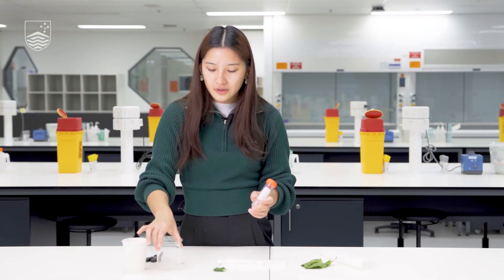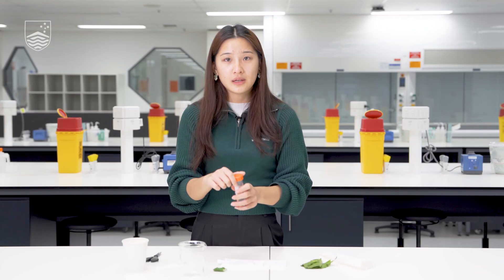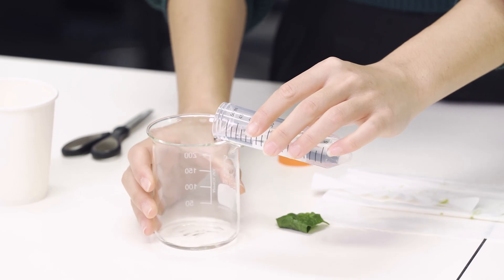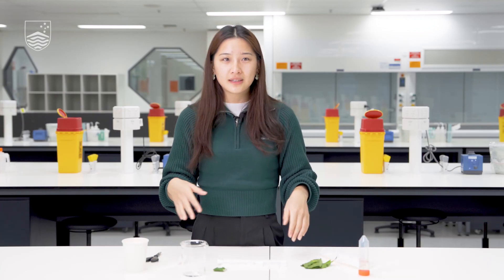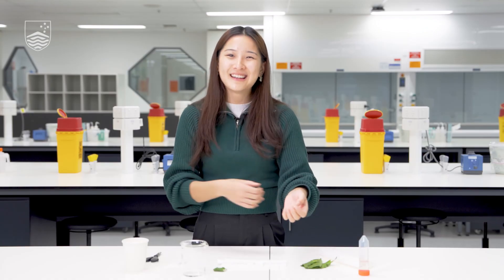The next step is to take your acetone and pour around half a centimeter deep into the cup or beaker of your choice. You don't need to use very much at all. Prepare this step only once you've finished your filter paper sample, because the acetone will eventually evaporate if you do it too early.